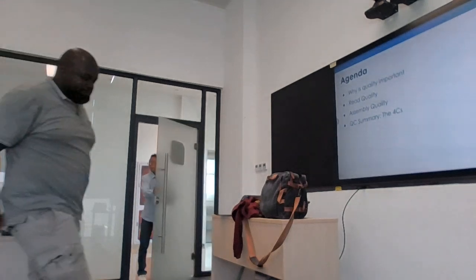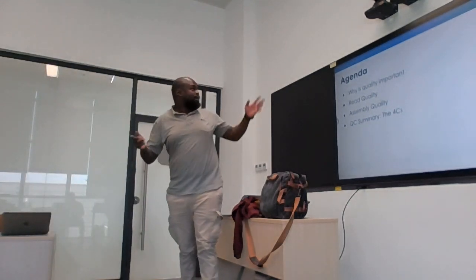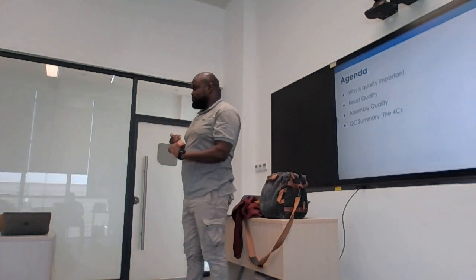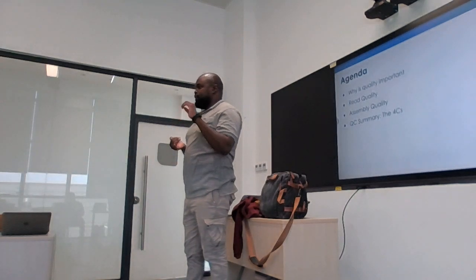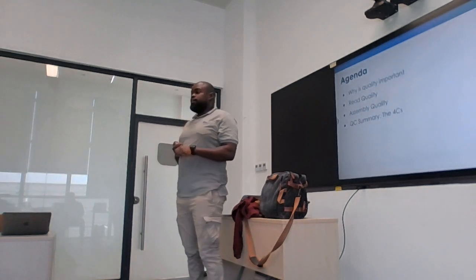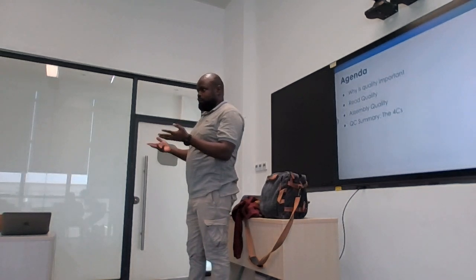We can continue. So, we did go through epidemiology last week, correct? And we did FastQC and MultiQC. And the idea there is to get a sense of the quality of your data.